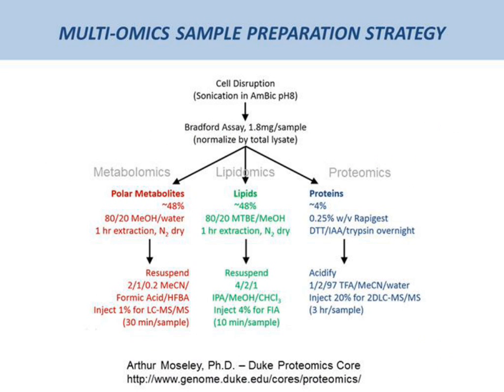Traditional methods intended to extract a distinct class of analytes may not be able to preserve other types of sample molecules, or even fail to capture the entire class of desired analyte molecules, leading to an inevitable sacrifice in sensitivity, or a need to use orthogonal methods to prepare multiple sample aliquots for specific workflows. As omics methods enter clinical applications, the demand for working with small samples like tissue biopsies require optimization of sample preparation methods towards multi-analyte approach.